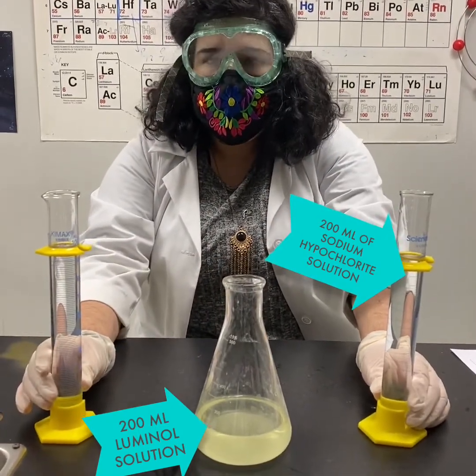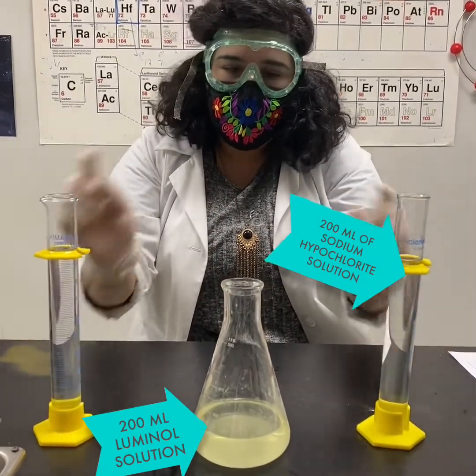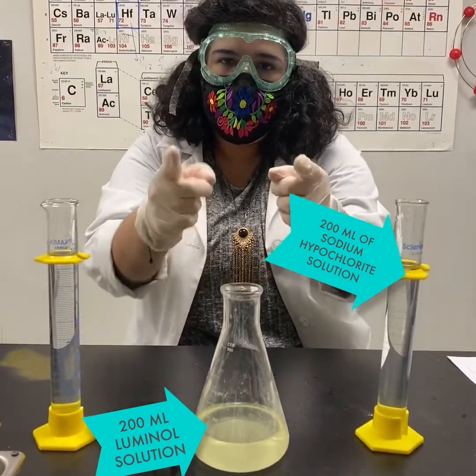I've measured out 200 milliliters of Solution B and 200 milliliters of Solution A. Make sure you're pouring Solution A into Solution B. Let's see what happens.